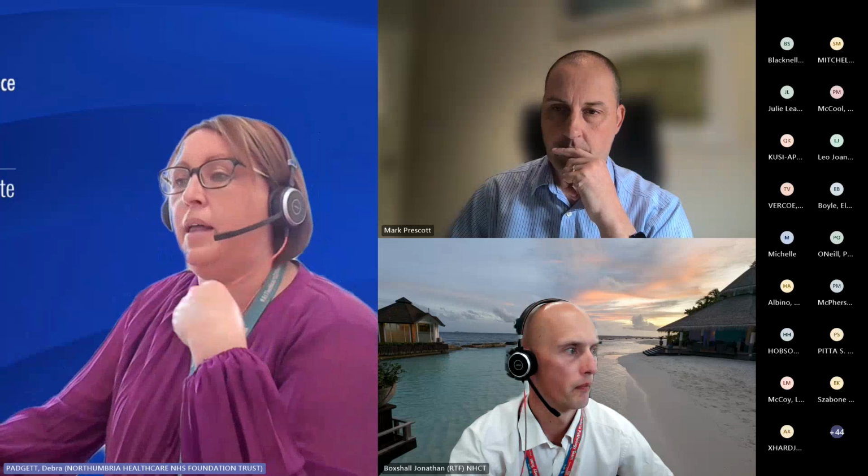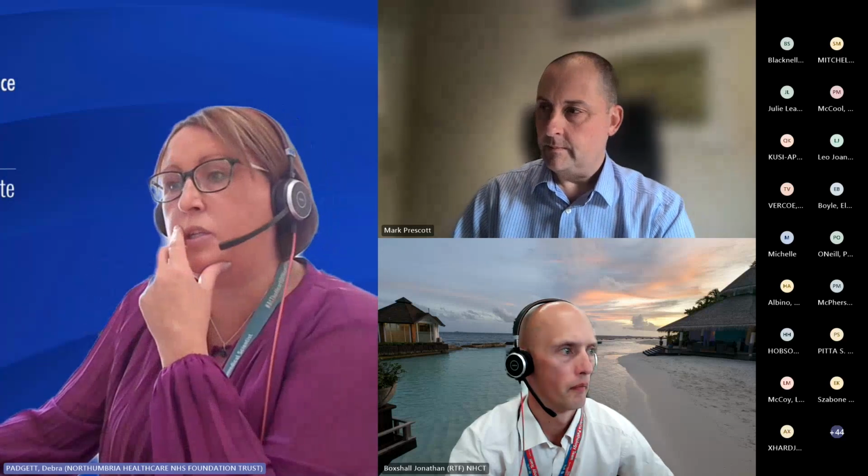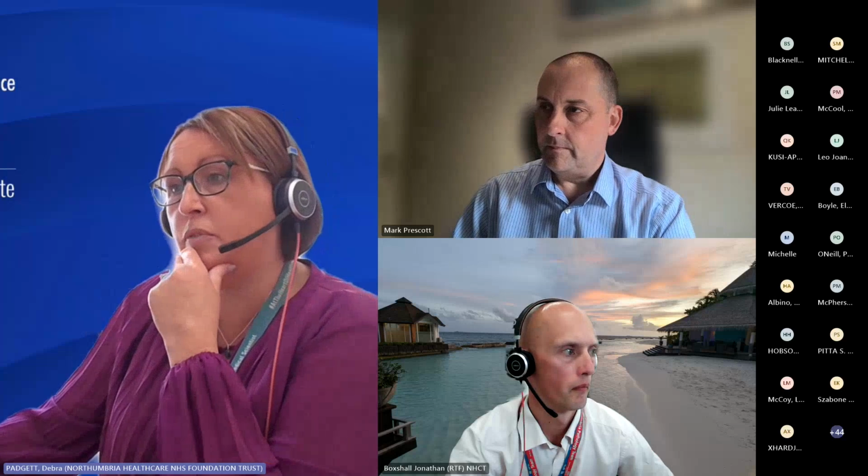Should we do a couple that specifically relate to your comments around direct patient reporting and the responsibility for counselling of that patient? A couple of questions have come in. Regarding reporting results directly to patients, does UKAS deem the lab responsible if the result is sent to the requester's system and then forwarded to the patient app?